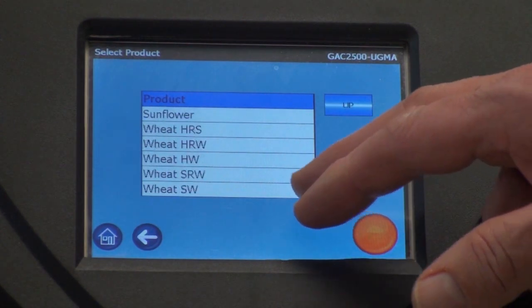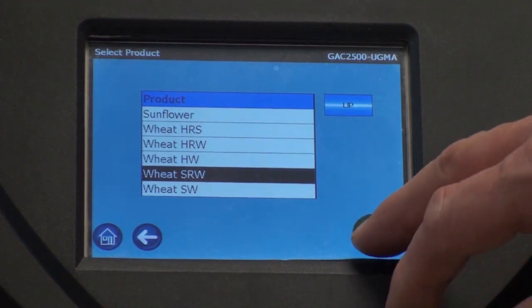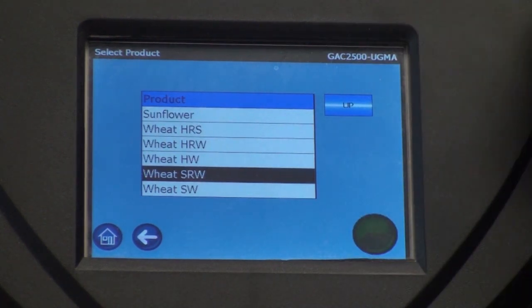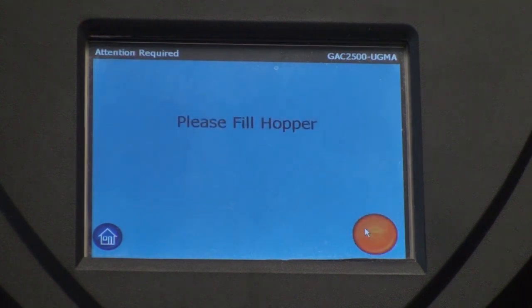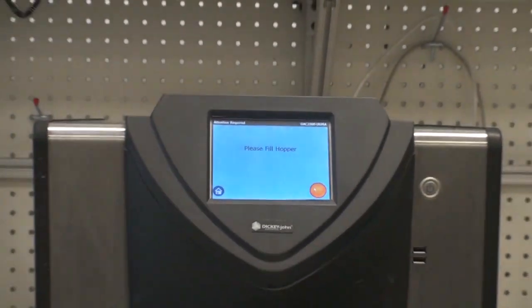Choose analyze and you will see all of those files loaded into the product menu. You can navigate down through there, select the one you want to run, press the green button and you're ready to analyze. You can then remove the USB stick and file it in the appropriate place.